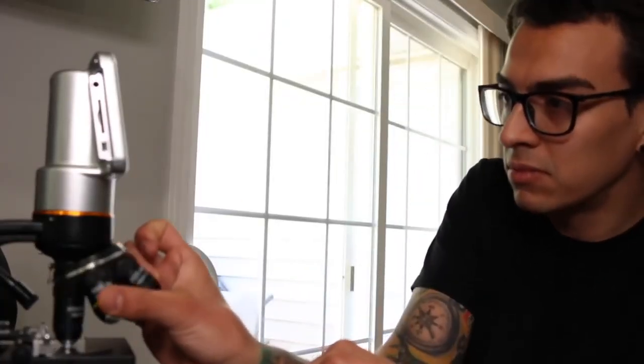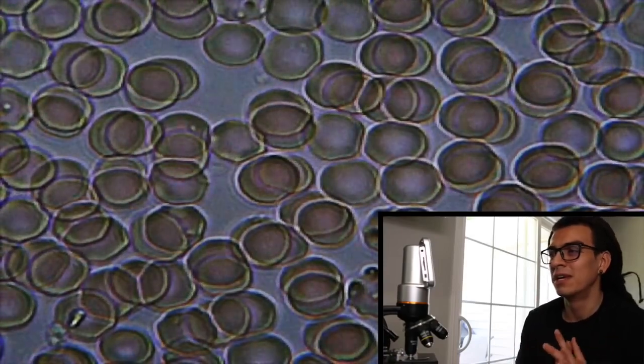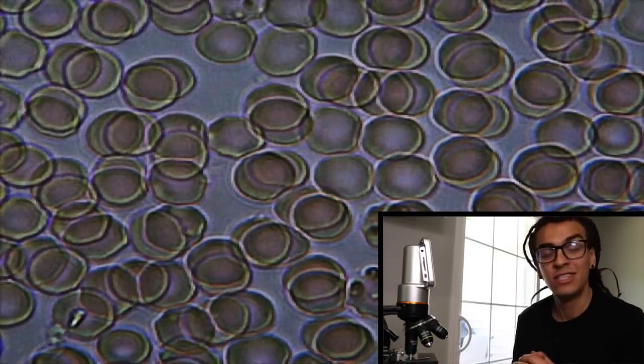So now let's go to 60 times. And there it is, guys. You can see them barely moving, but they should be moving. They should be all over the place, and it's crazy.